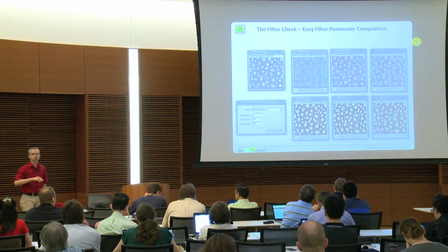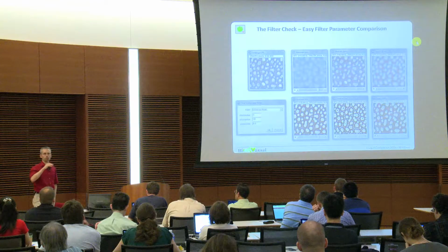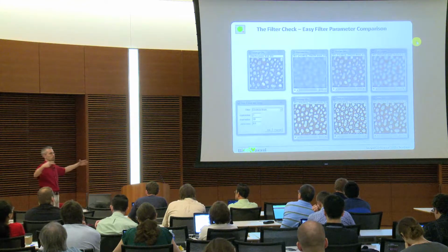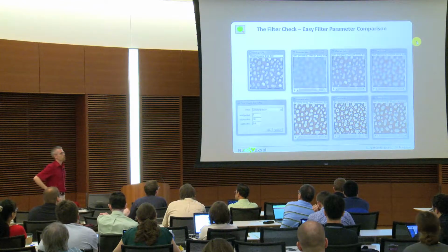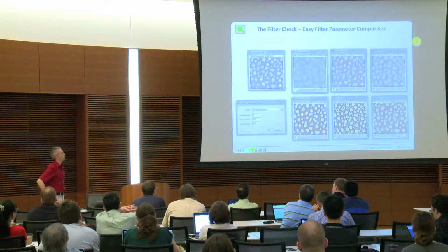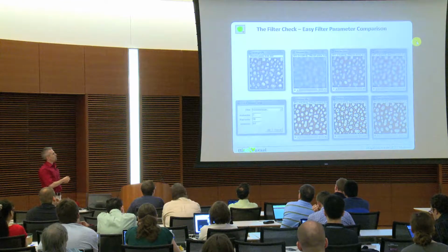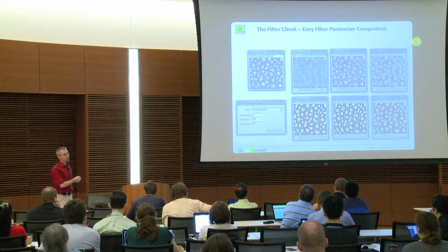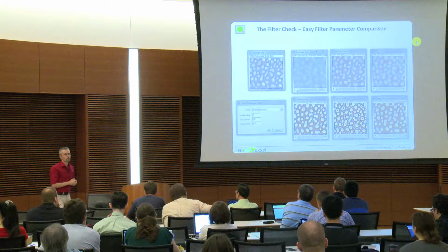versions of the filters, because you've seen normally what we do is when we filter, we key in a radius. This is for our filter size. The bigger the filter, the more it normally convolutes or blurs the image. In that case here, you see that we have two radii. We need to key in a starting and a stop radius.